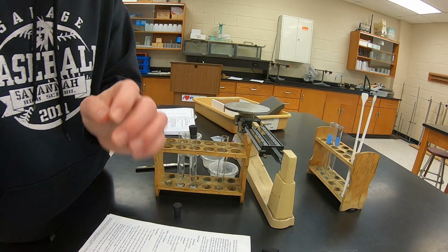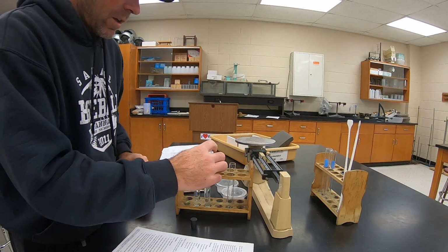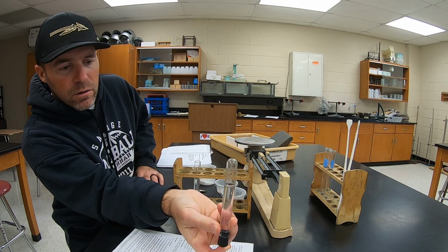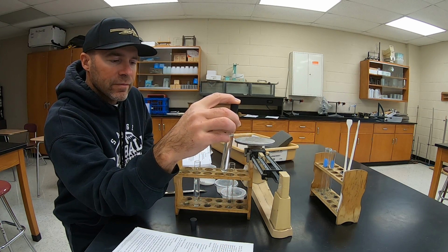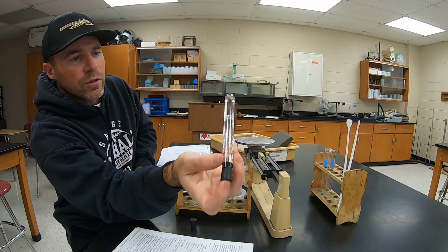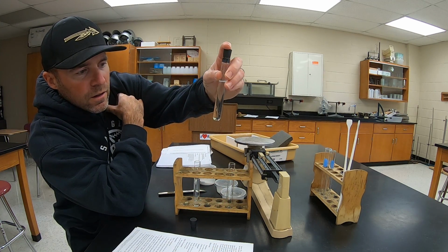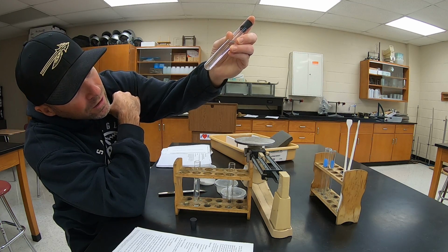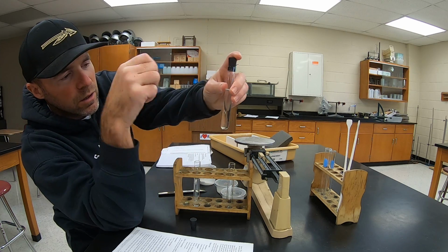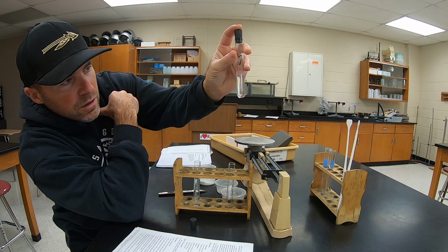And we're going to invert it the same every time. Let me move this up a little bit. And so all that I'm going to do is just take it and flip it all the way over. So that's one inversion. And you can see, might be hard to see on there, but there's still salt in here. So we're going to do another inversion. There's still a little bit of salt in the bottom, so we're going to do another one. And you can see after 3 inversions that all the salt is gone.